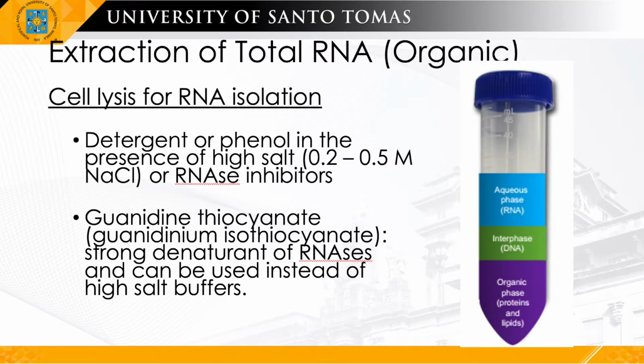So, cell lysis for RNA isolation, we use the following materials for the organic technique. Number one is your detergent or phenol used in the presence of high salt, around 0.2 to 0.5 molar, or in the presence of RNase inhibitors.